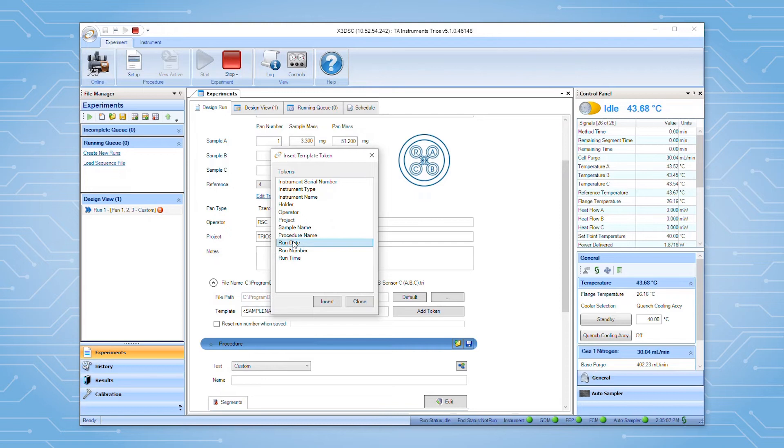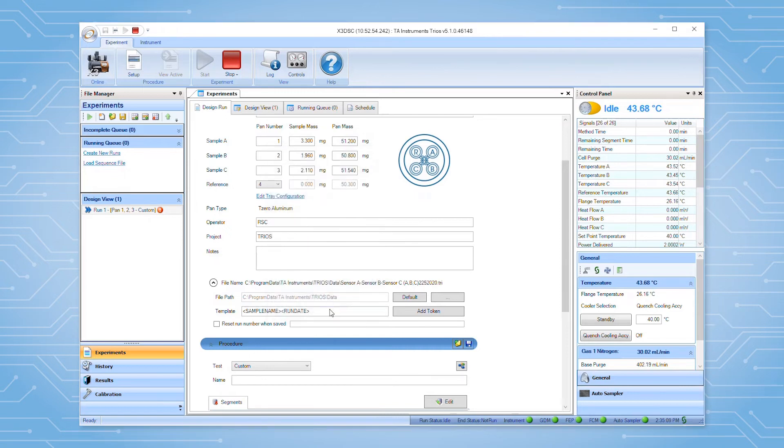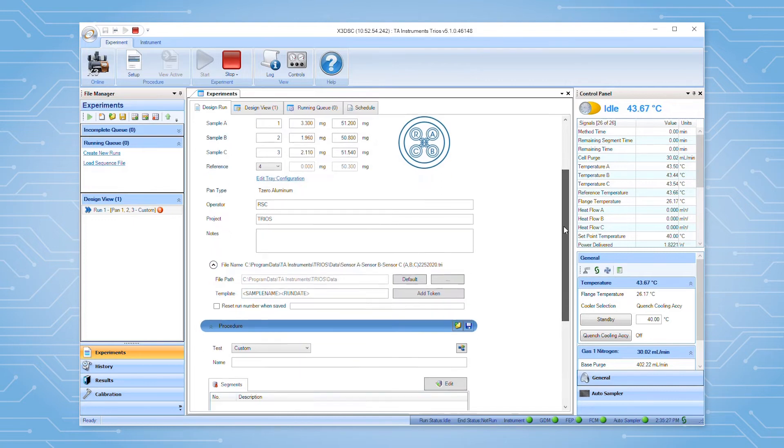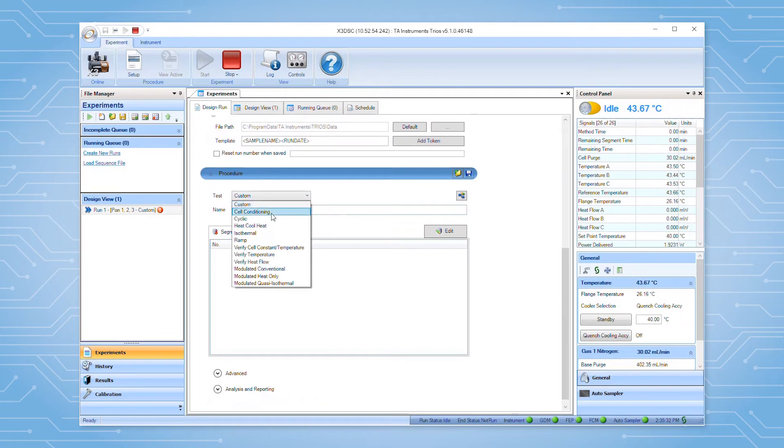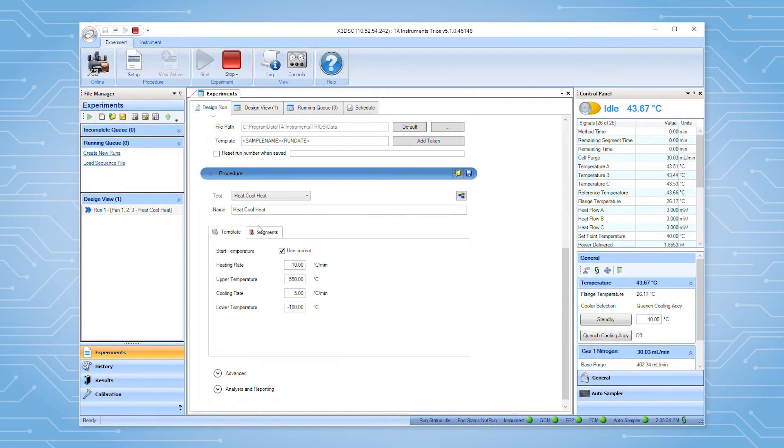Once the sample information has been set, we can move on to programming the experimental conditions for the test. The test list contains several templates for common DSC experiments that can be used as a starting point. Once loaded, the experimental parameters in the template can be modified as needed.